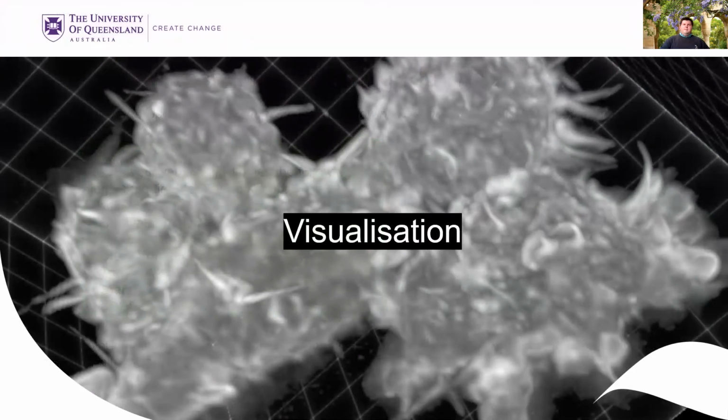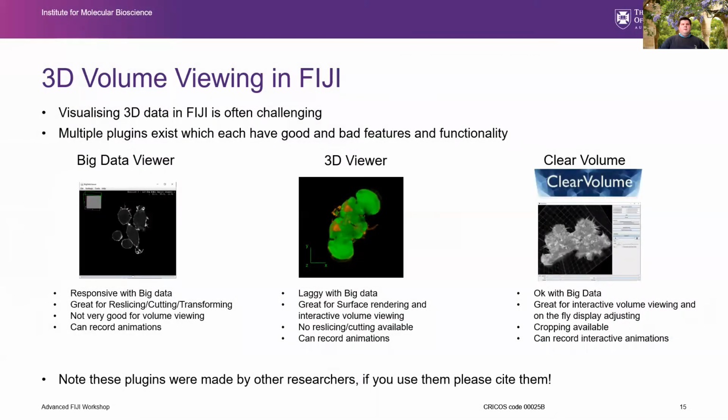The first plugins that we'll be looking at in this workshop are visualization-based plugins. There are 3D volume viewing plugins in FIJI. There are a number of these. These have not been developed by me, they're developed by other people, and they have different niche markets where they really excel.